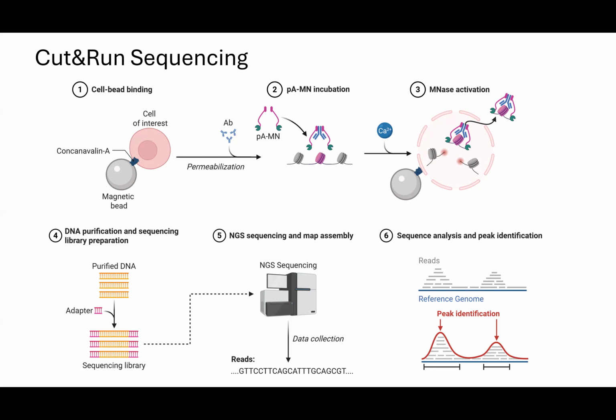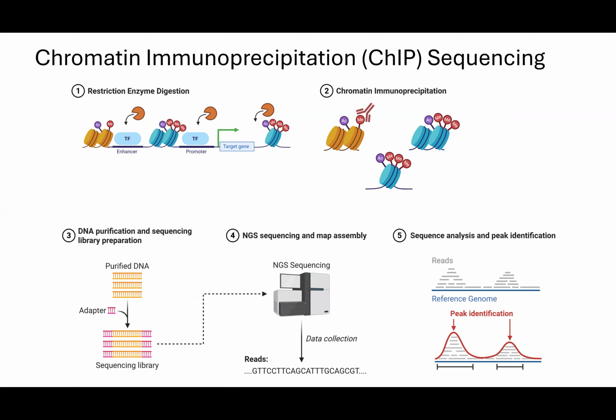Generally, as long as you're treating all of your samples the same, at least you can compare them to each other. But between different buffers or nuclei isolations or chromatin isolations, it will be quite a bit different for sure. The other thing I didn't mention in detail is that for ChIP sequencing, you're usually going to do some sort of cross-linking with PFA. That keeps things a little easier to compare and a little more stable for these interactions.